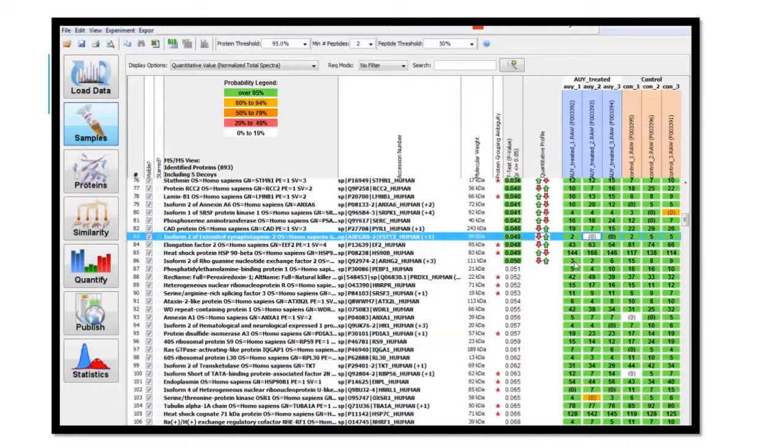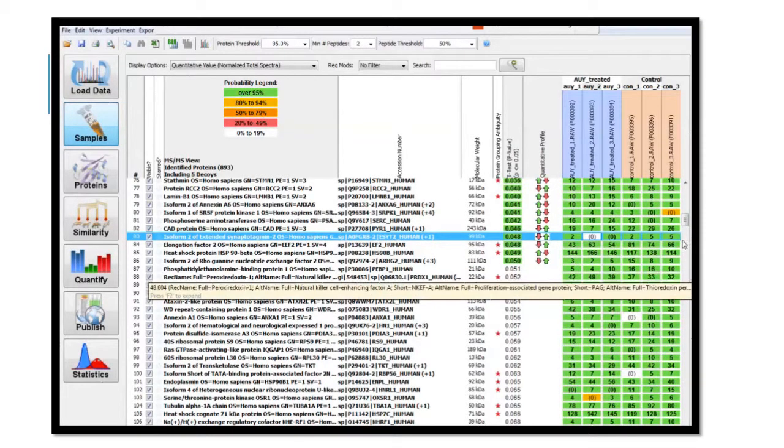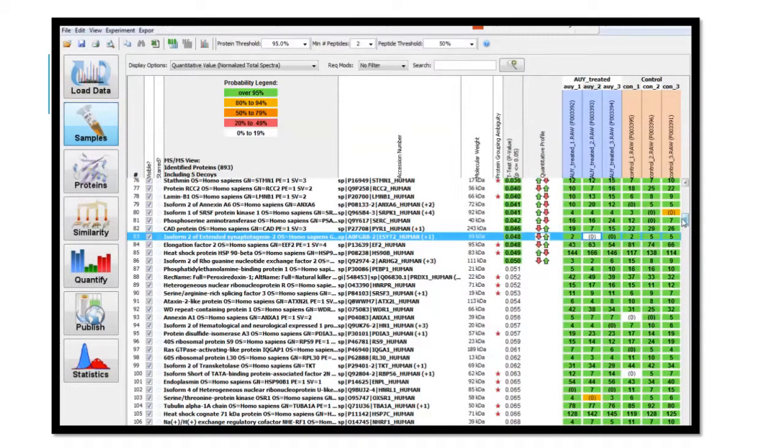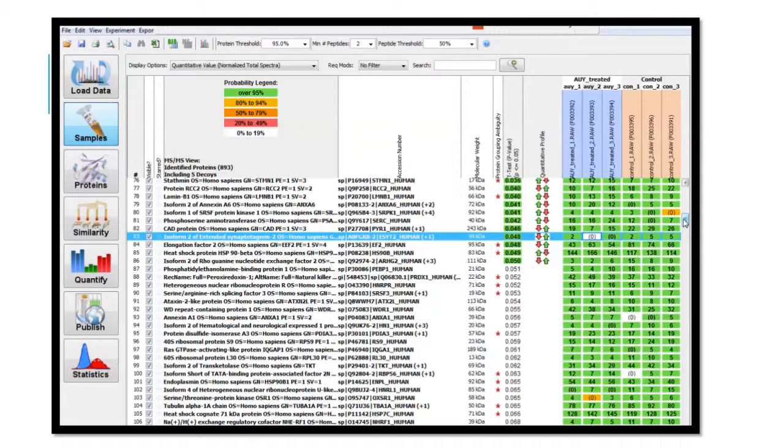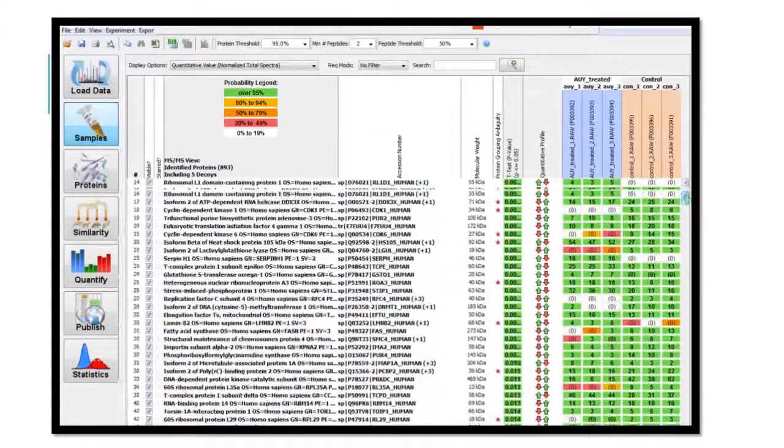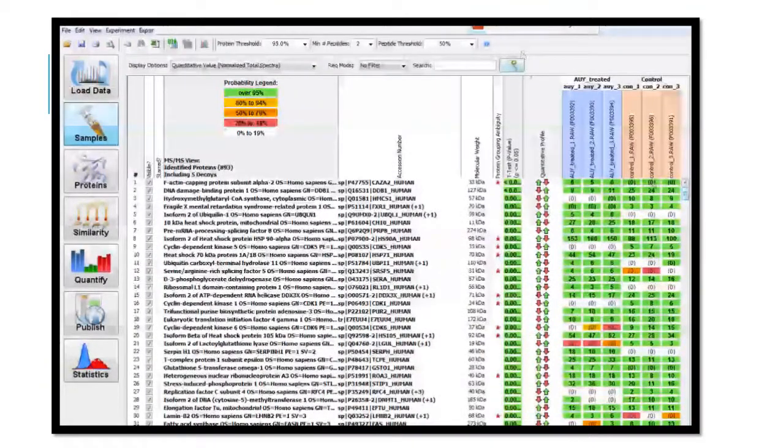Conduct this type of analysis for your chosen protein. Remember to choose a protein whose expression is statistically significant with a student's t-test p-value of less than or equal to 0.05.